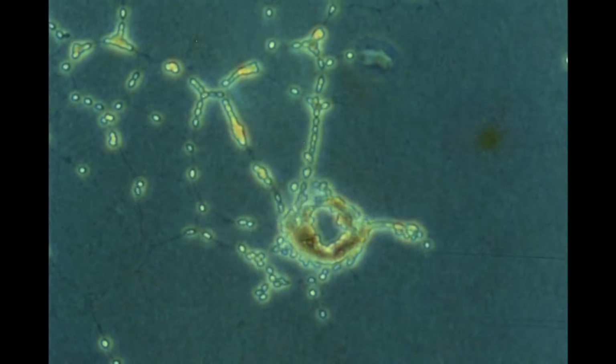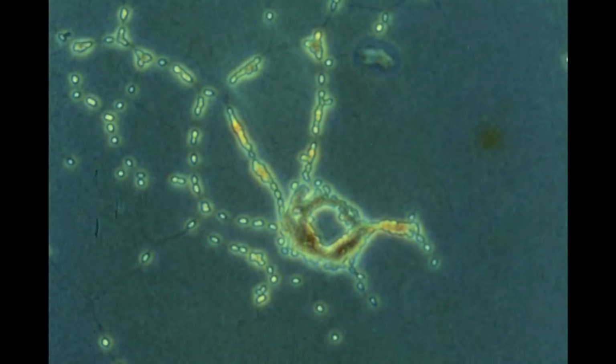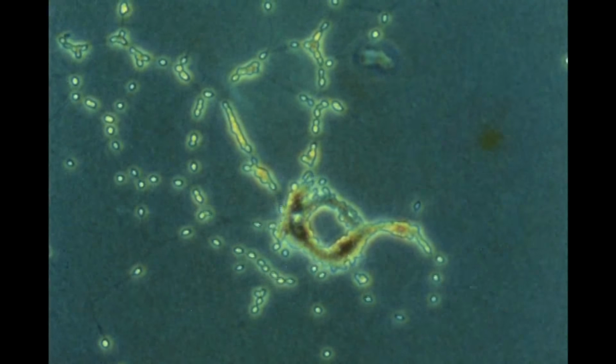Many cells will aggregate in the older parts of the colony, but these aggregations lead only to poorly defined encystment structures.